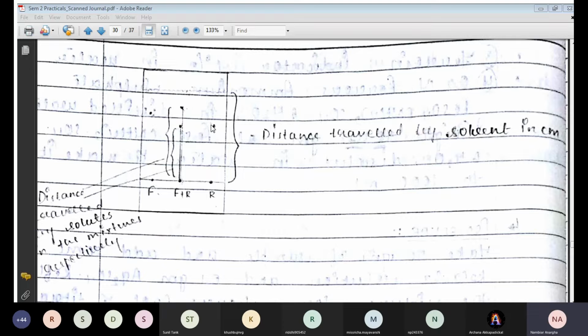Now, in order to understand why we are using standards fluorescent and rhodamine, why can't we directly use fluorescent and rhodamine's mixture in our TLC plate? To understand that, see now, this is because it is naked, we can see with naked eye, acha, we know fluorescent color is yellow, so it is for fluorescent, and the separated mixture yellow colored one is for fluorescent and the other one is for rhodamine. You can know because this is being colored.